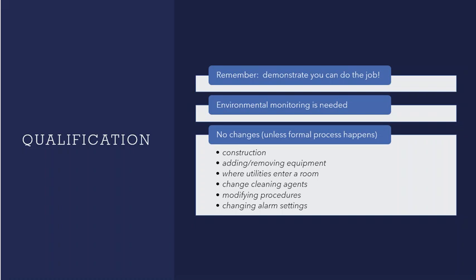Okay, FDA auditors are going to be similar. They're going to come in and take a look at how these people are doing their jobs to make sure that they have the proper training, they know what they're doing, they know why they're doing what they're doing, and that's all part of the qualification piece that these facilities have to go through. So under qualification, these laboratories will be visited. Absolutely, they will be, and you need to demonstrate that you can actually do the job. So are you familiar with your job? Do you know exactly what you're supposed to do? Have you been given the proper training? And they can ask you questions and interrogate you a little bit on what you're doing.